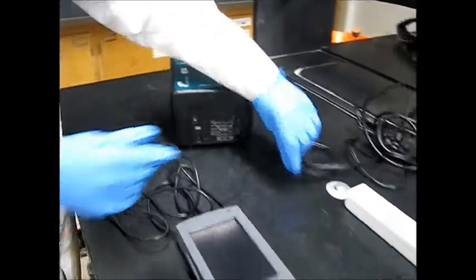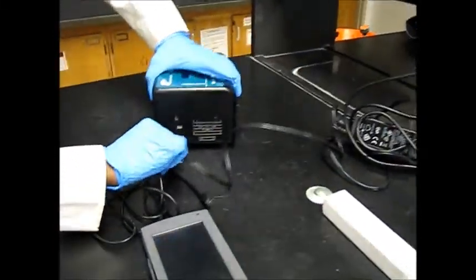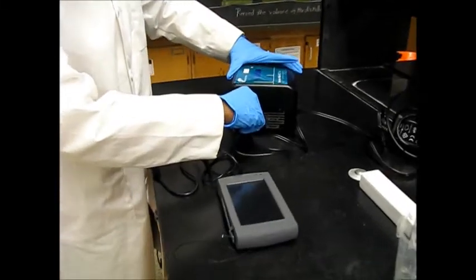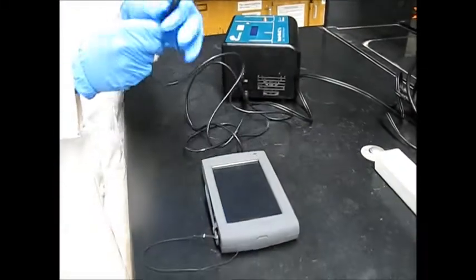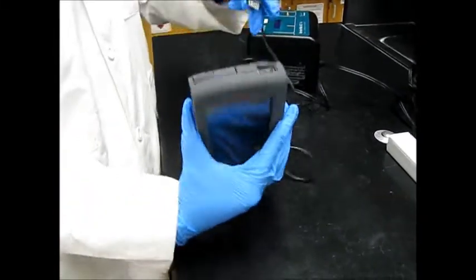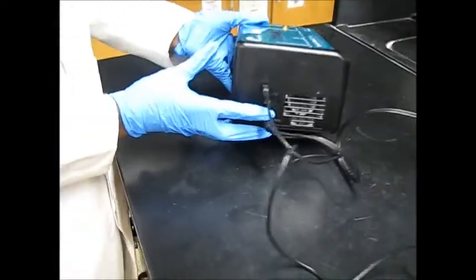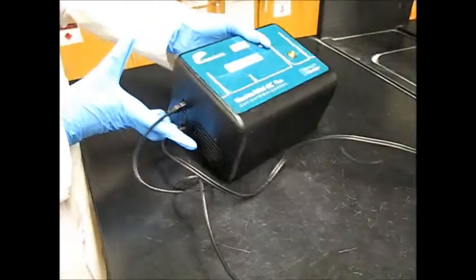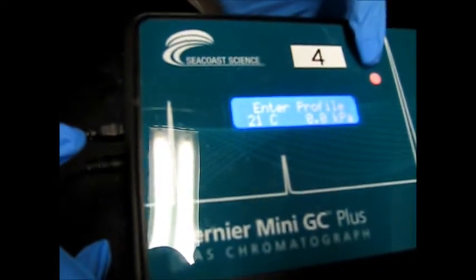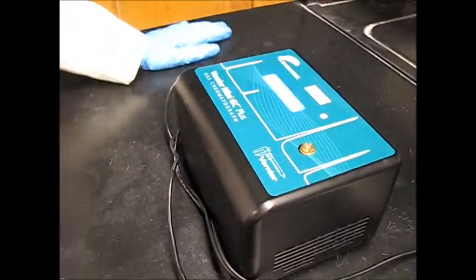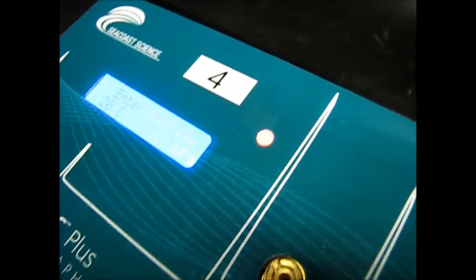So we're going to start by plugging it in. So here is our power source. We're going to plug it in. At the bottom, we're going to use this connector to connect our LabQuest through the USB. So here we have our USB. We're going to go to our USB portion, plug in our LabQuest, and then we're going to power on our GC, pushing this button. So now you can see that it is now on. The red dot shows that it is not ready to be used yet. So we have to wait for some time till it reaches normal temperature and it will show the green color.